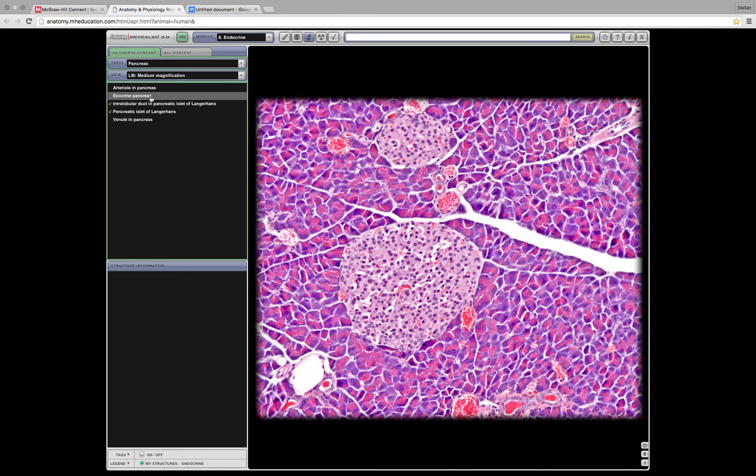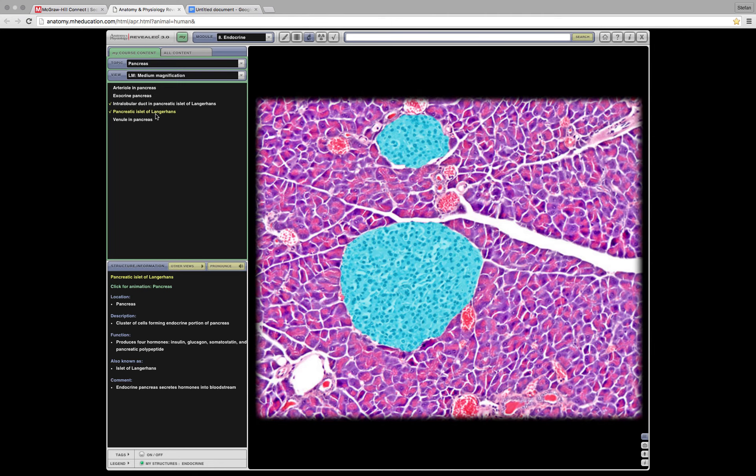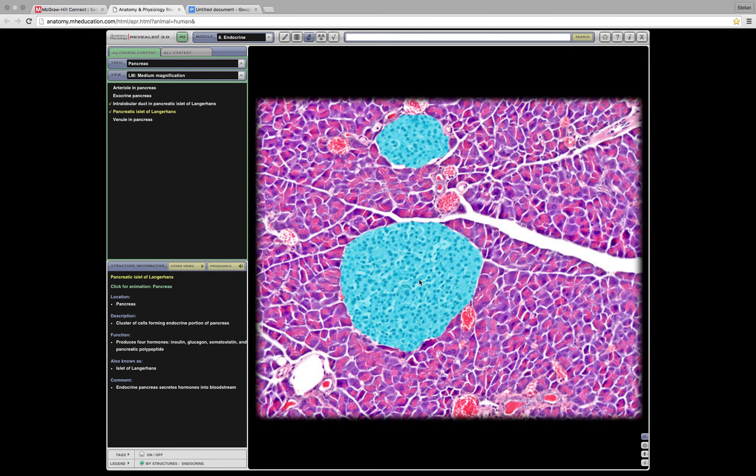You want to look at the pancreatic islets. The big circles with the, I don't know what those are called inside. I don't want to say the word perennials because I'm not sure if that's anatomically correct. But the big circle with the small dots inside. That's your pancreatic islet.